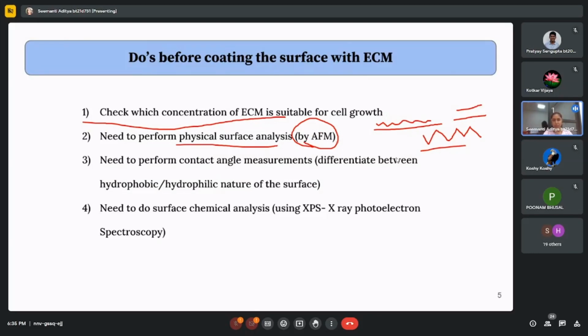In atomic force microscopy, the principle is that we have a small cantilever. This is called a cantilever, and it is attached to a rod-like substance. What happens is light shines on the top of the cantilever, and it reflects the light based on how much it is dipping inside or outside.